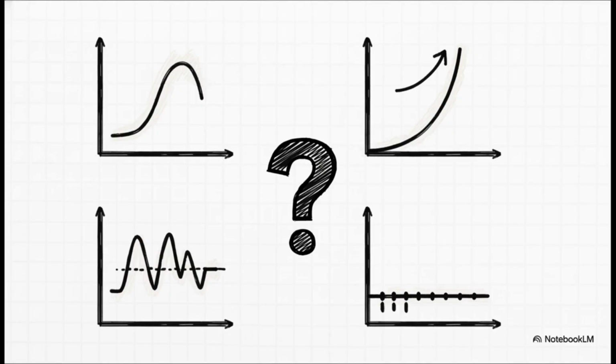Maybe your top standard reads unexpectedly lower than the point right below it, or, bizarrely, your highly concentrated samples actually increase in calculated signal after you dilute them. Wait, what? Yeah, you might see non-monotonic recovery in parallelism experiments, or honestly, the worst one, your top replicates are super precise, very believable, but totally biologically implausible. These aren't just random noise artifacts, guys. These are the real-world symptoms of a failing standard curve.